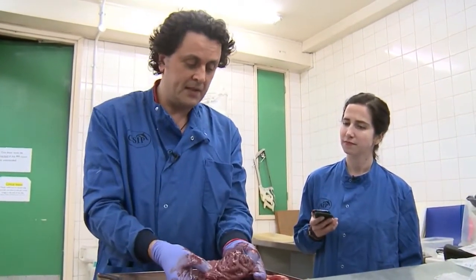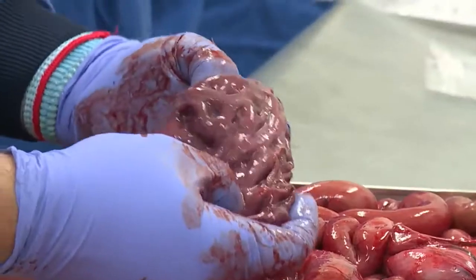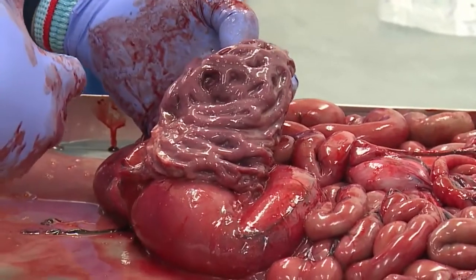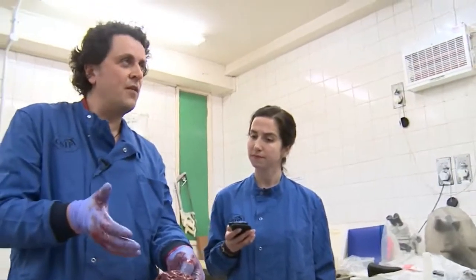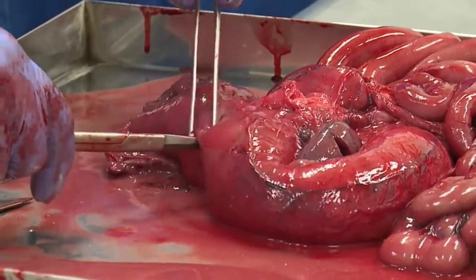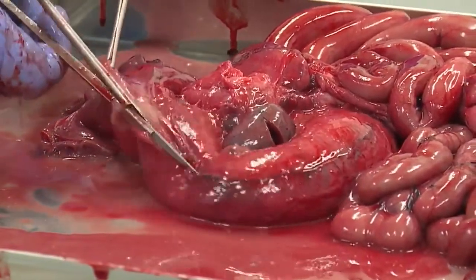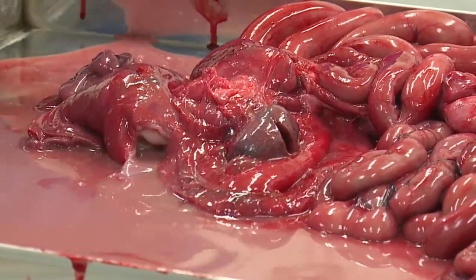It's quite folded to increase the surface area, and this produces the enzymes. So the enzymes are secreted here, they're refluxed or passed back into the first stomach, takes the flesh off the fish, and then flushes it through into the next stomach, and this is the pyloric stomach here. And this is where the dolphin adds bile to the mix. I'm afraid that's where it's going to get quite smelly now, sorry chaps.